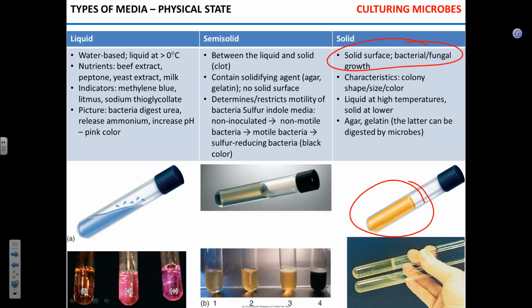Color. I'm going to take this lab that we did and use it as an example. Color. You had yellow, you had white. You already can tell apart two different species. Some of you did have that. The large white colonies, like big ones, that was bacillus. It looked completely different. So colony appearance helps you to identify the microbes.